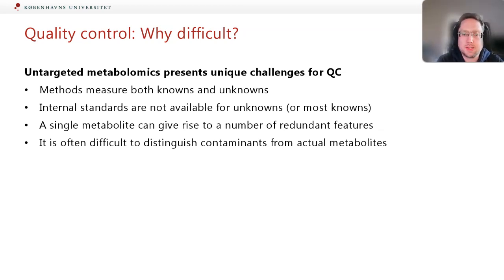You have now created a peak table, but you should be wondering, is it any good? How do I know if I did well? We will look at some of the ways to check the quality of the data. But first, let's look at why it is so difficult to know if untargeted metabolomics data is good.